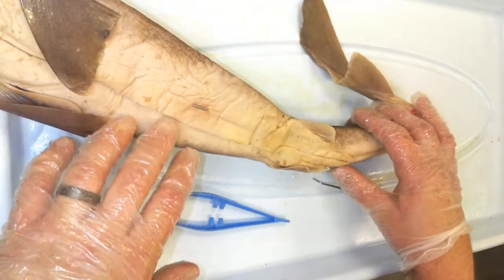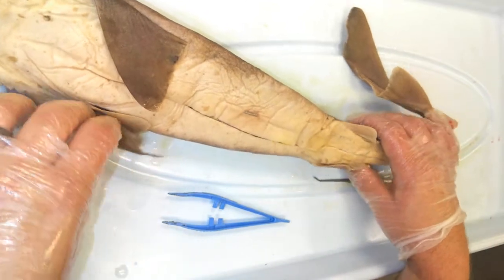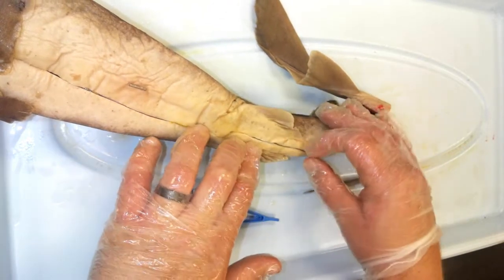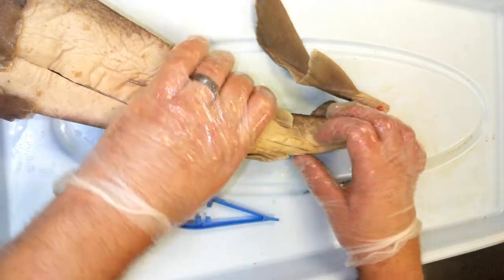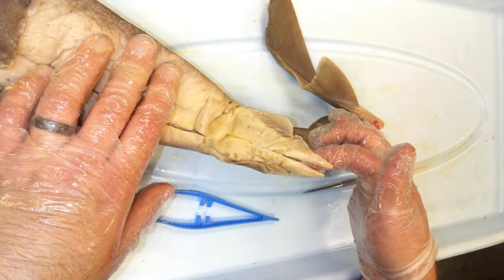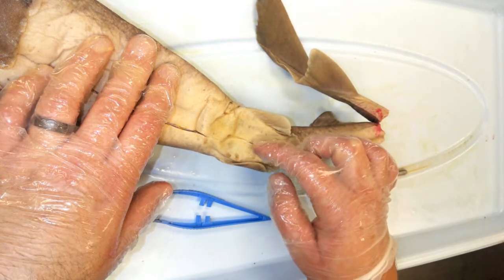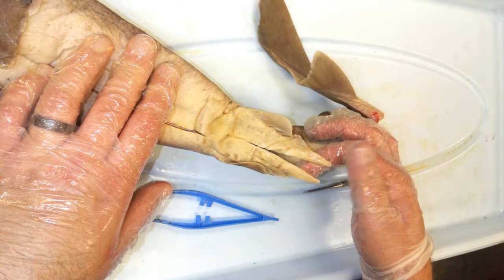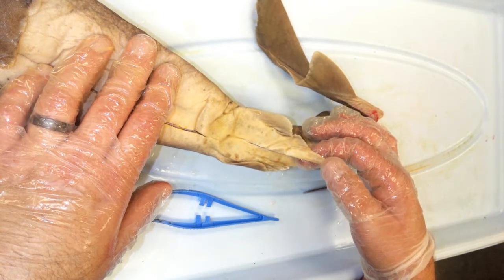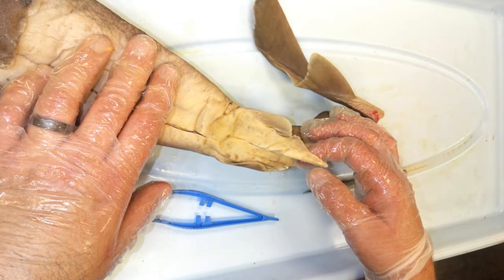The last feature I wanted to go over is determining the sex of the shark. You can see this by examining between the pelvic fins on the ventral side. In between the pelvic fins we can see sex organs — these pencil-shaped structures are called claspers, which tells me this is a male shark. Female sharks do not have claspers; instead they have an opening called the cloaca. When male sharks mate, they insert one of these claspers into the cloaca of a female and release seminal fluid inside.